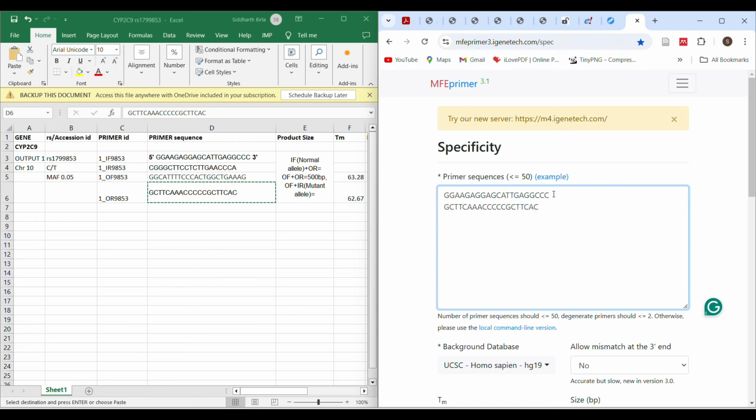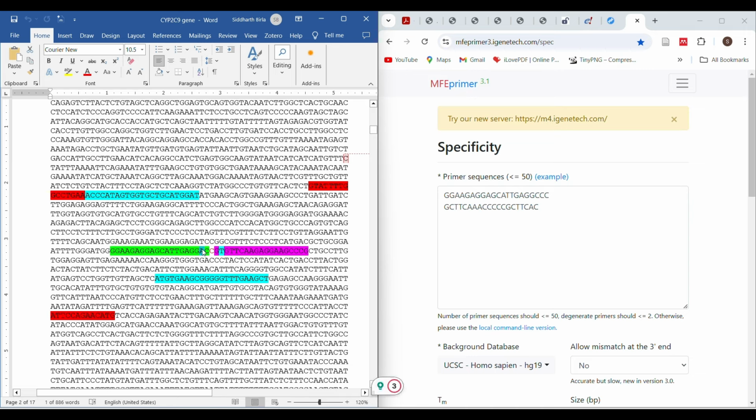So when I remove the mismatch, this should form a product, right? So after removing the mismatch, the product should be 1, right? As you know, in the ideal condition it should be 1. So we'll see what mismatch is there, what we have to add here. If you see here, you can see my cursor.